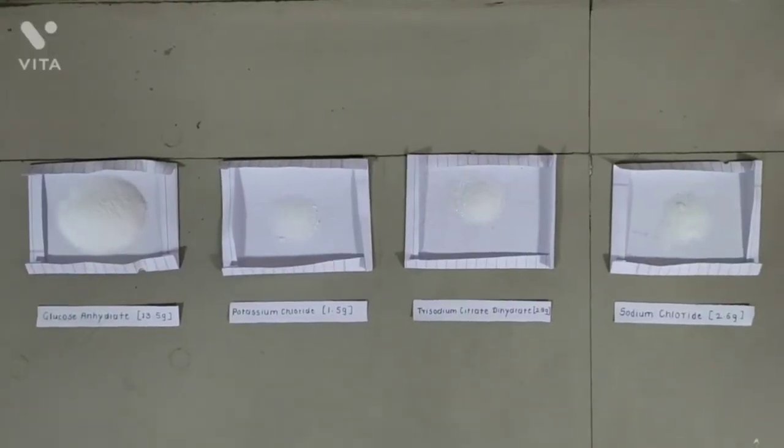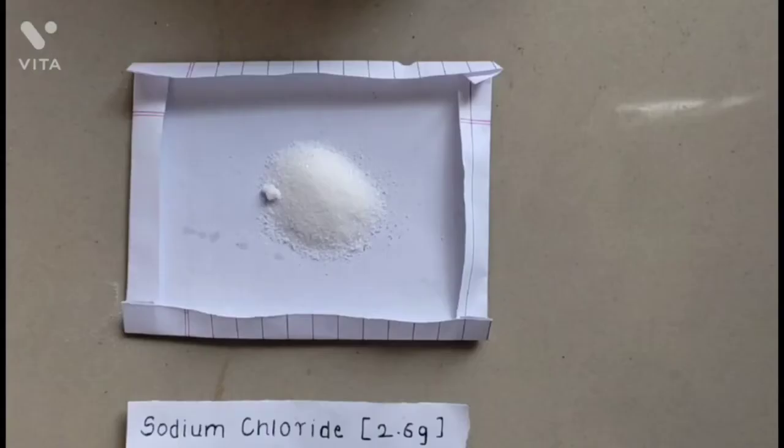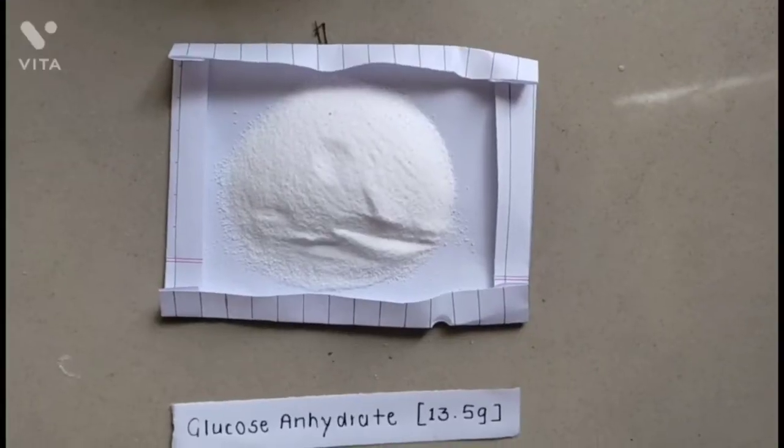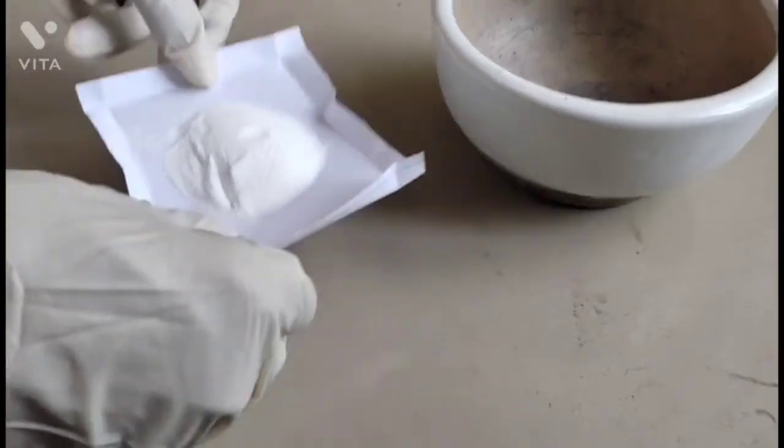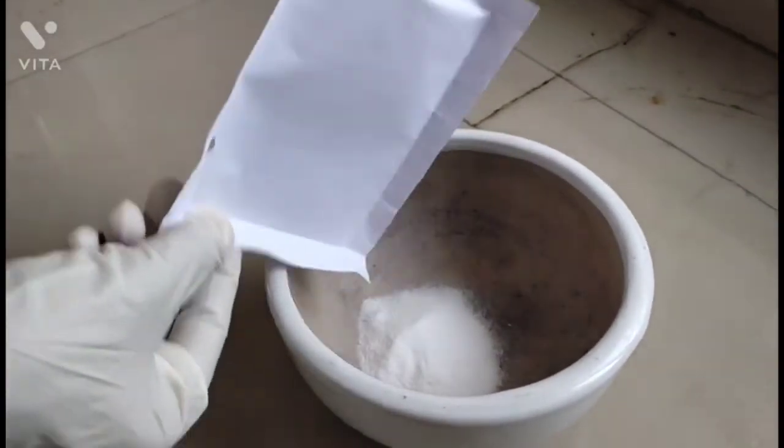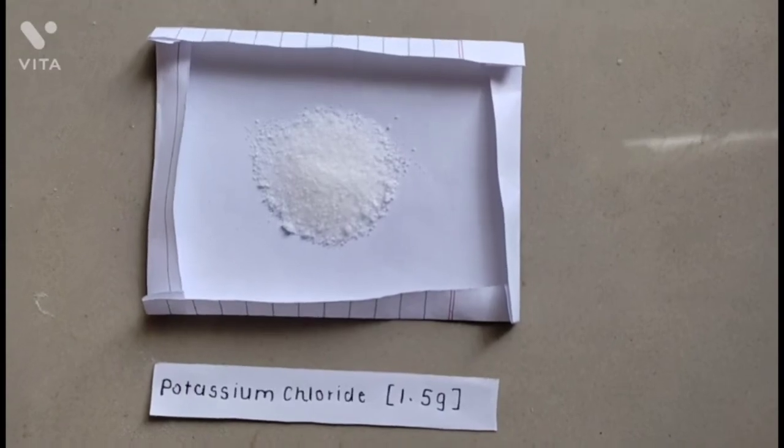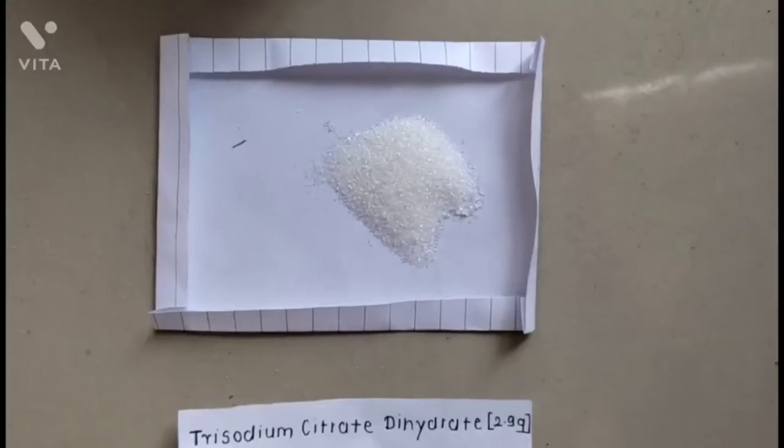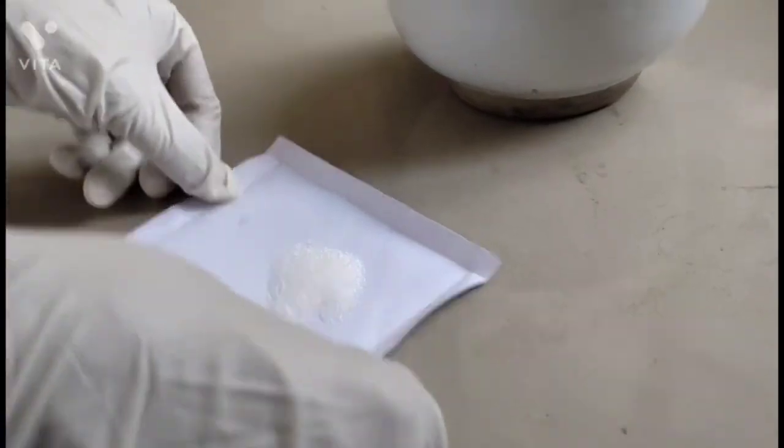Let's start preparation of ORS powder. First add 2.6 gram of sodium chloride. Next add 13.5 gram of glucose anhydrate. Then add 1.5 gram of potassium chloride. And lastly add 2.9 gram of trisodium citrate dihydrate.